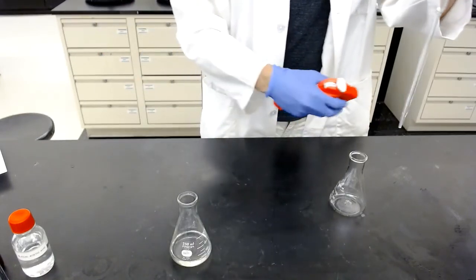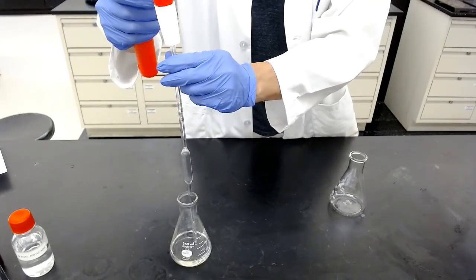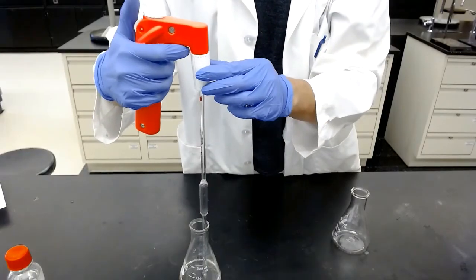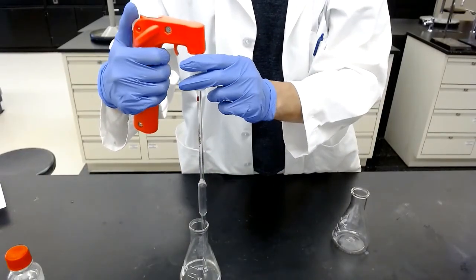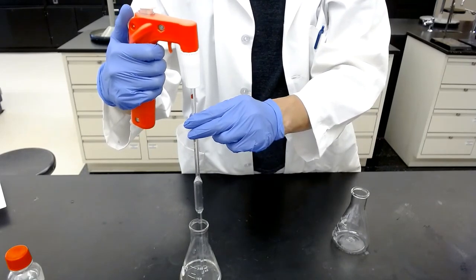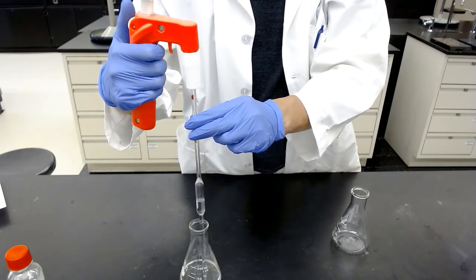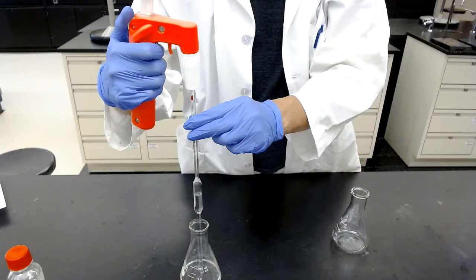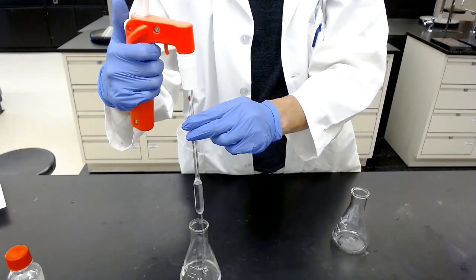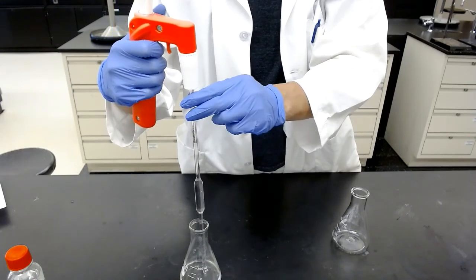So how do I do it? This is the stock solution. I dip inside, and then insert the top of the pipette into the filler gently. I slowly suck the solution up into the pipette. Do it slowly, because you don't want to go too fast, so the solution doesn't shoot into the pink filler in my hand. That would be bad.